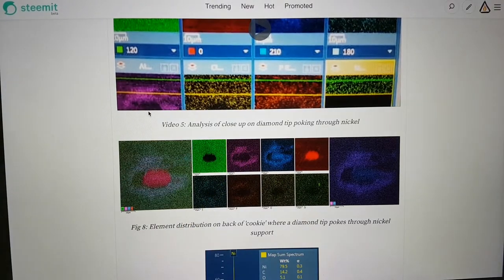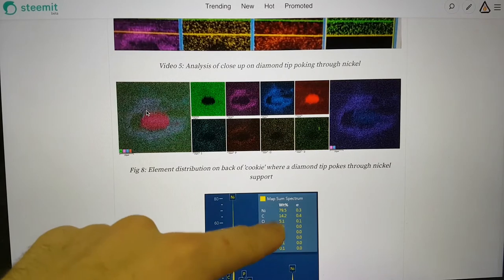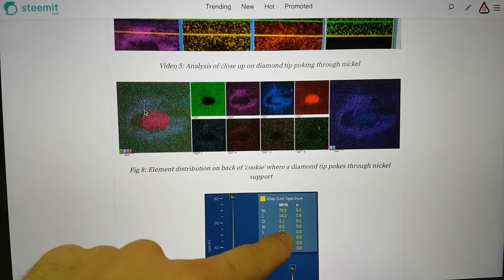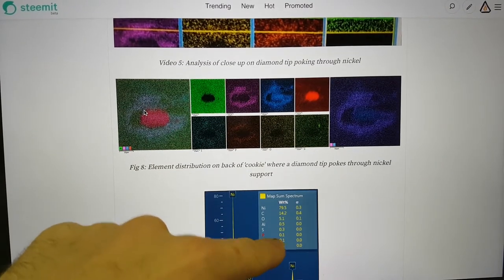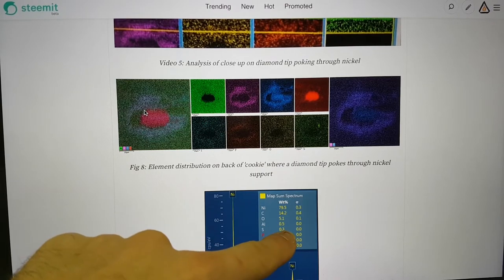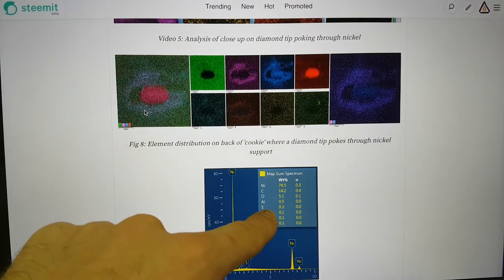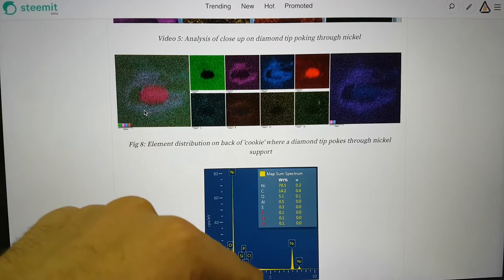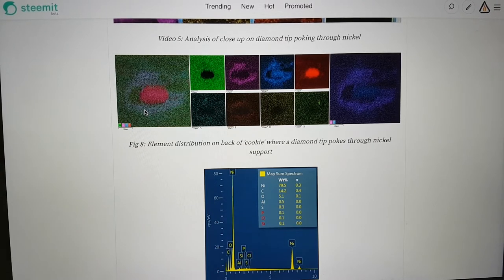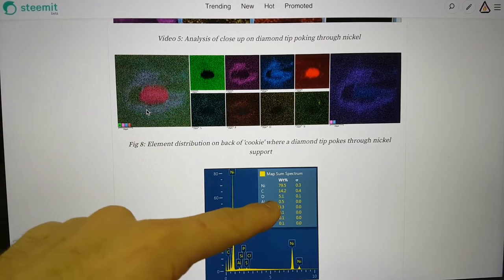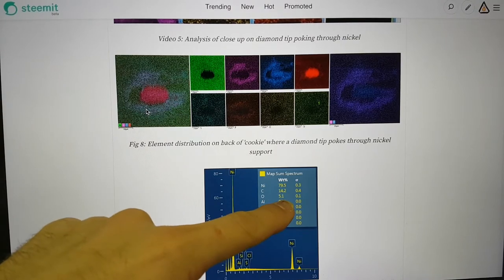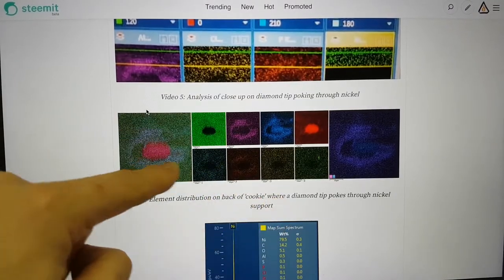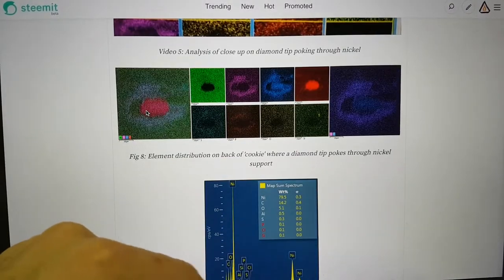I found that quite interesting. But essentially this is actually picking up with some certainty the sulfur this time because it's obviously closer in and getting more samples so it can be a little bit more sure about that.